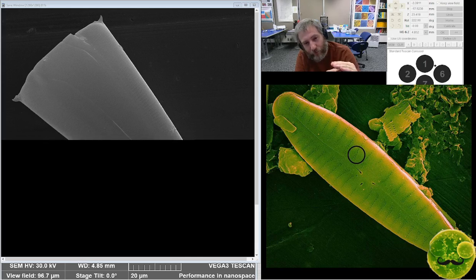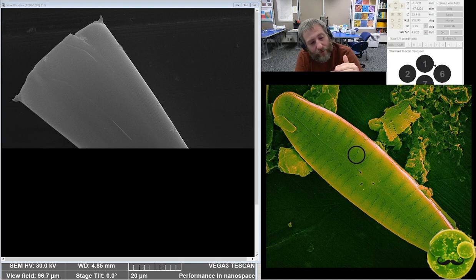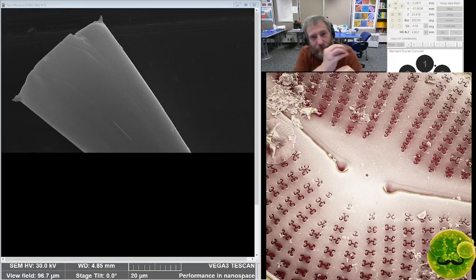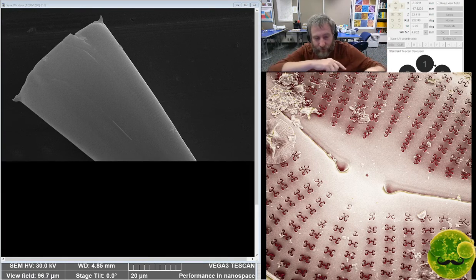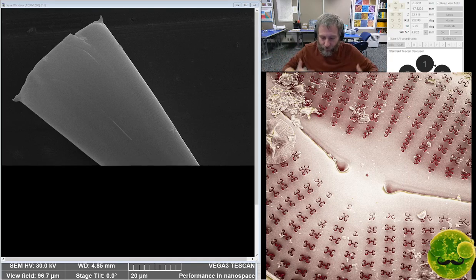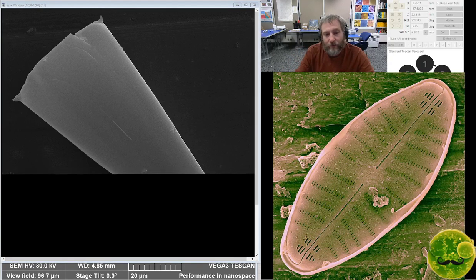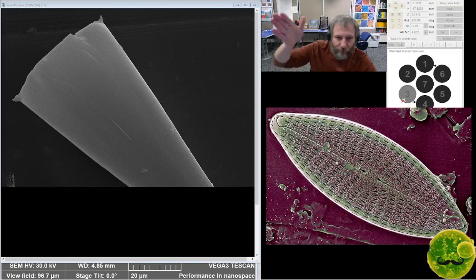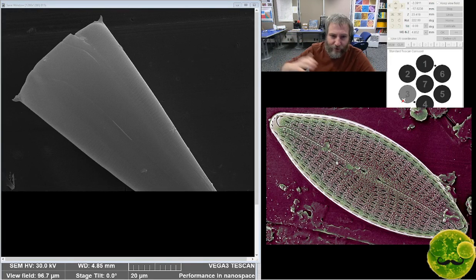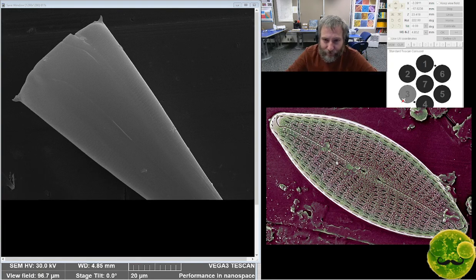And then electrons collide with particles, and they get ejected from the surface. I know what an atomic force microscope is. Those electrons get collected by something with a positive anode, and it scans across the surface. The response it gives you is topographic in nature. It's like a flashlight, essentially, using electrons as flashlights. So it's reflected electrons, or refracted electrons, whatever you want to call it, but it's basically like reflected light. So you're getting a topographic view.